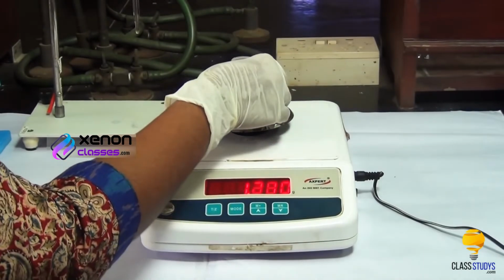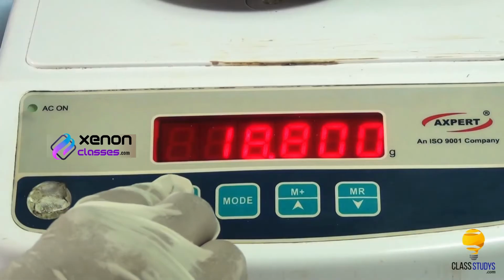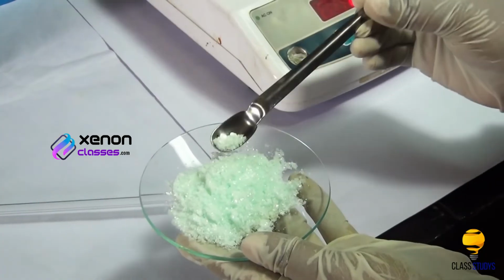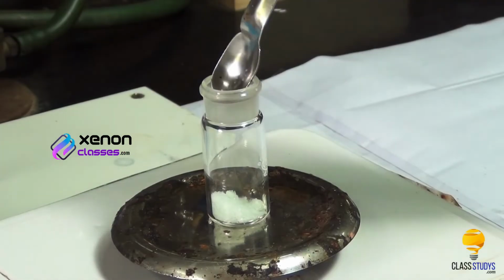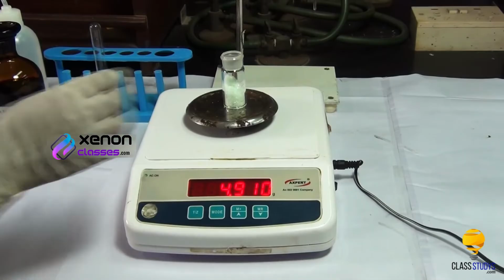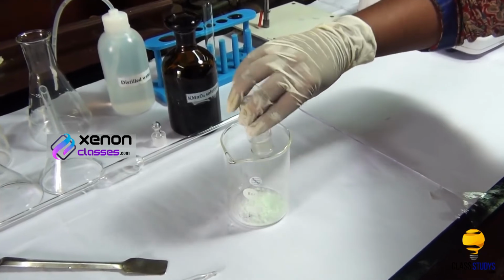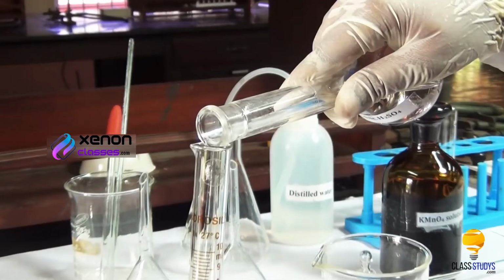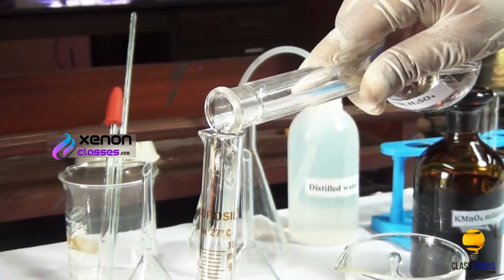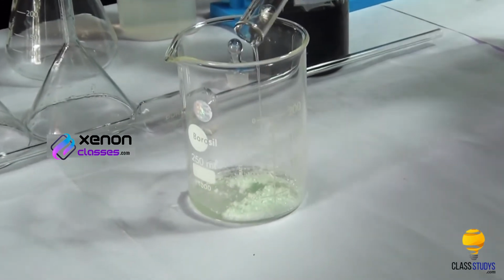Place the weighing bottle on the electronic balance and tare the balance. Using a spatula, take Mohr salt and weigh about 4.9 grams. Transfer the weighed quantity of Mohr salt into the 250 ml beaker. Now measure 5 ml concentrated sulfuric acid in a measuring jar and pour this into the beaker.